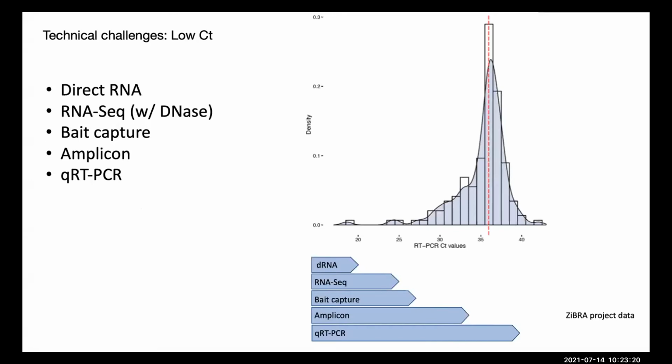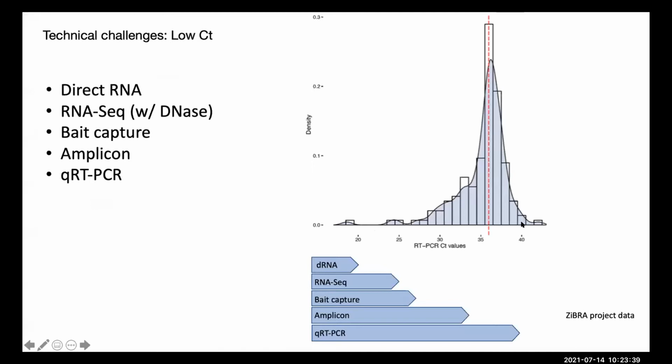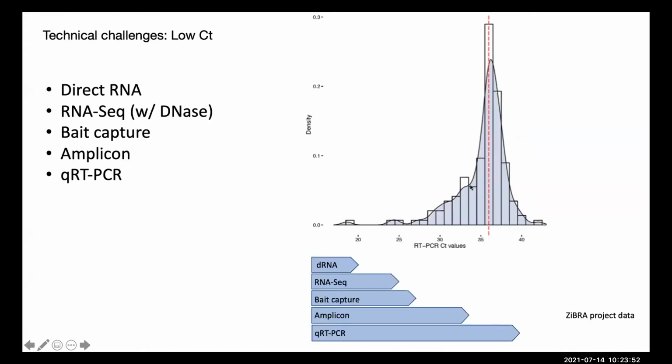And then in terms of sample suitability, this is a histogram showing the distribution of CT values for a diagnostic assay. This one's actually for Zika. But consider that your qPCR test is going to call anything positive that has a CT, cycle threshold, below 40. I am aware that CT isn't the best measure of viral load. With a calibration curve, converting it to copies per mil is a much better method, but most people use cycle thresholds, so that's what I'm going to stick with.